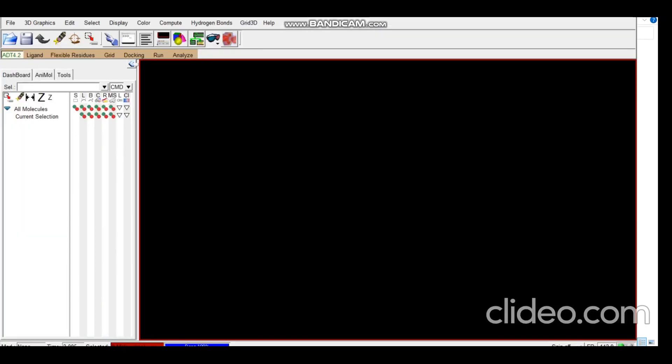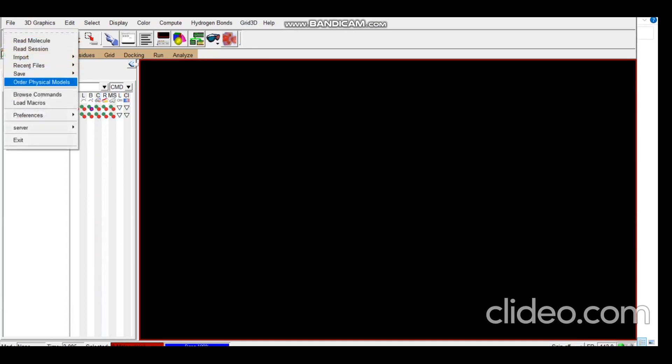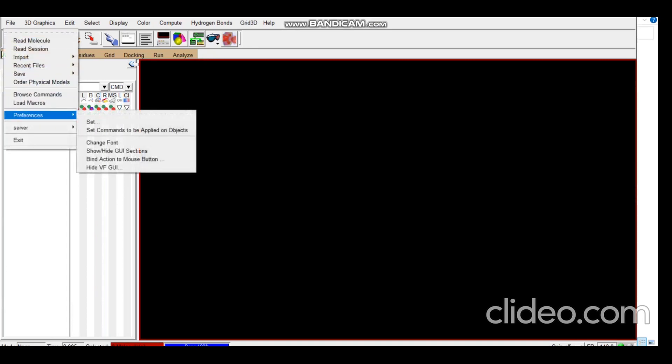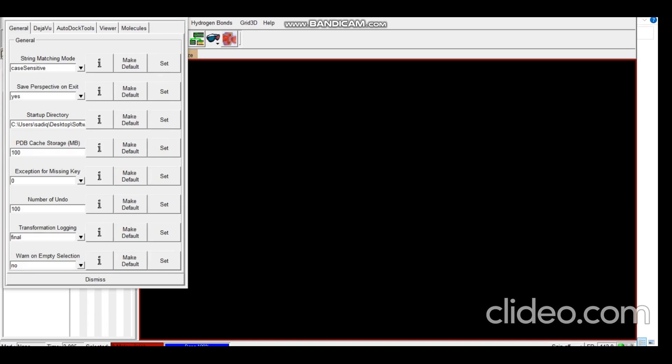Now in AutoDock Tools, the first thing you need to remember is to always set your startup directory preference to the folder in which you will have all your receptors, all your drugs or ligands, 3D structures, everything. You can see references set and this is my startup directory and I've made it default.